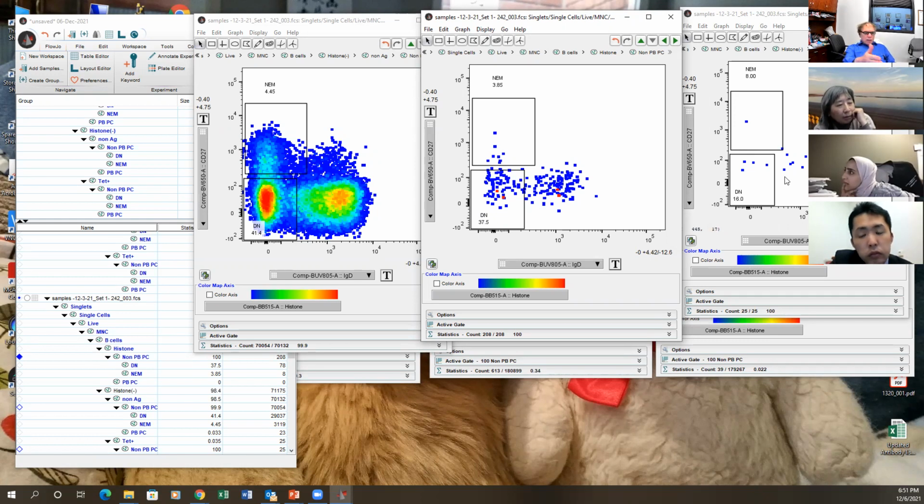What is the middle one? It's the histone. Same. 242. This is histone. Oh, histone, SNRP. Okay. So that's possible. Yeah, it's possible. So what is your theory, Dr. Su? I did not get your theory.